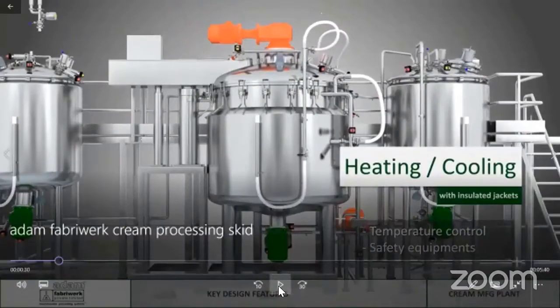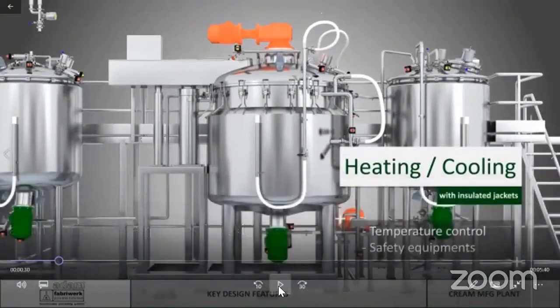Within the system, there is for each vessel option for heating and cooling with insulation. There is temperature control with safety features built into the system so that for critical products, temperature does not overshoot the set points.